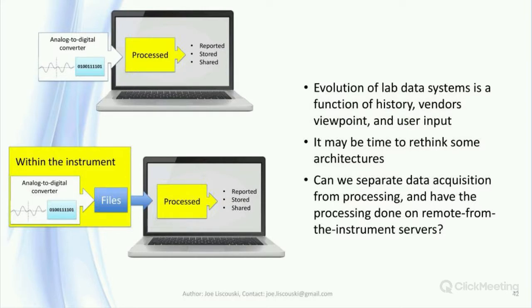It would require the solution to two issues. The first is standardized file formats for data in two tiers. One tier is the structure of the tray with samples and standard information. The second tier is the data for each sample. Work along these lines was begun several years ago and it remains to be seen if it will be successful. The second issue is security and protection against tampering with the data, to ensure that data integrity issues and fraud are prevented.